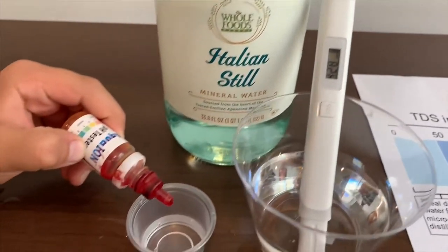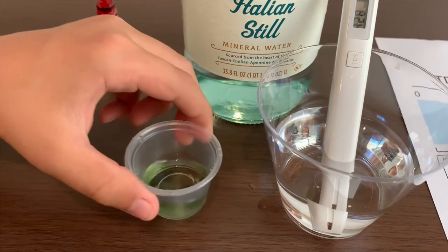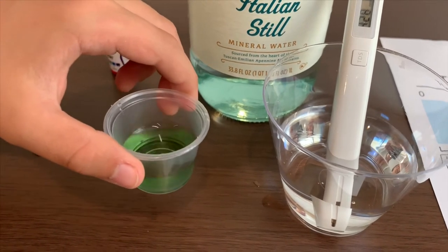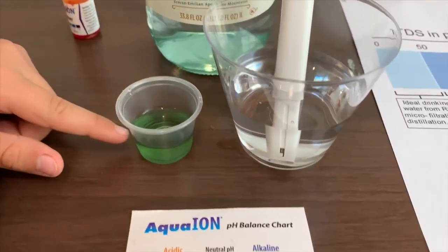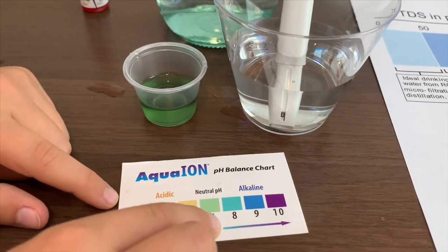Now, let's test the pH. It is 7. That is neutral pH.